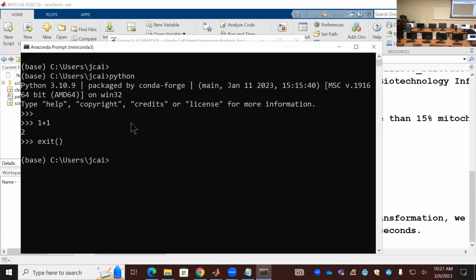Oh, you can save anywhere. You can save to local. Just save, give it a new name, and next time you can load it back. I don't think this is a good place, maybe this place will be good.